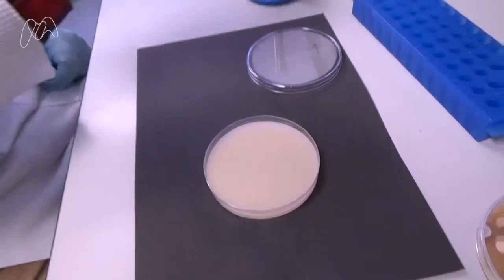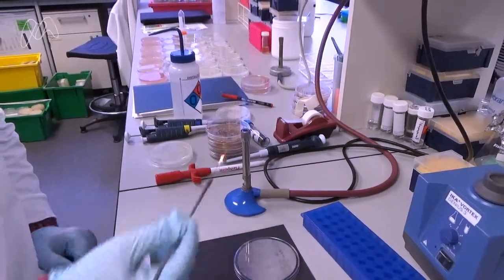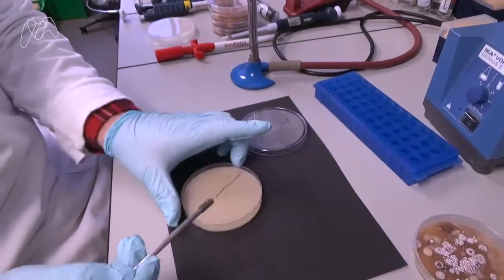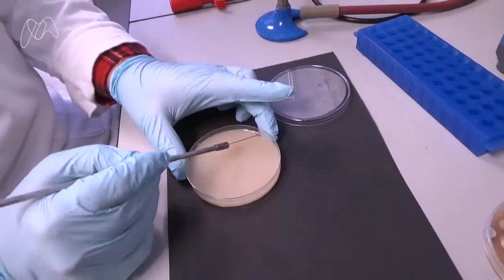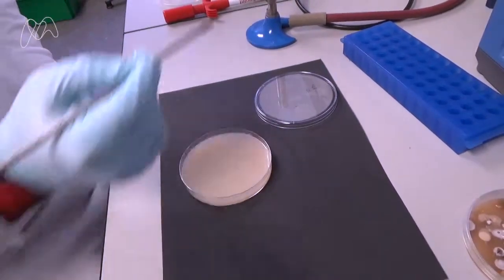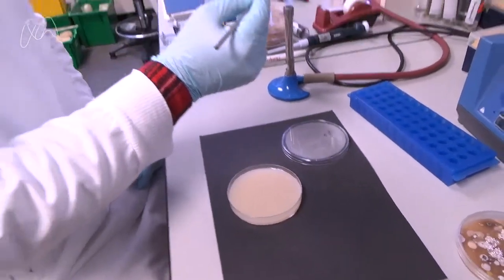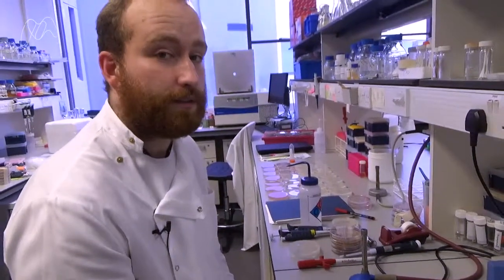Then we have to re-sterilize the loop to remove any excess bacteria. And then we spread it around the plate. The reason we do this is because we're hoping to isolate a single colony of a single strain.